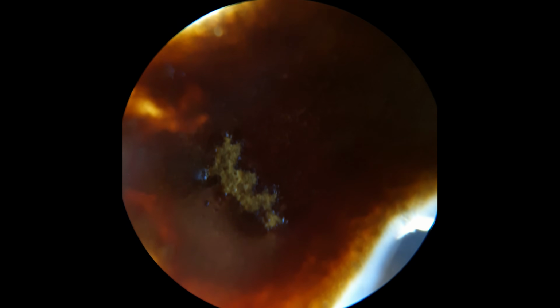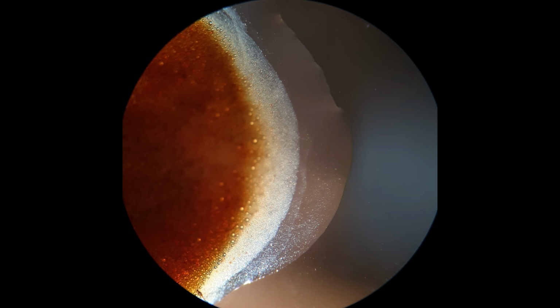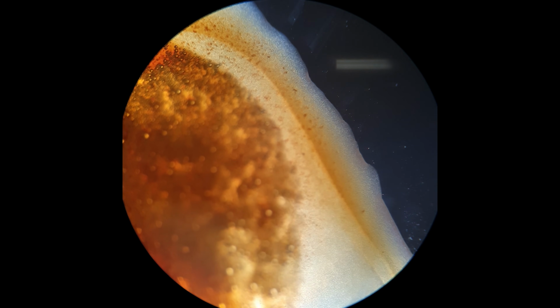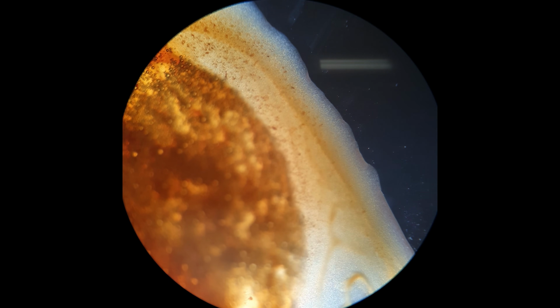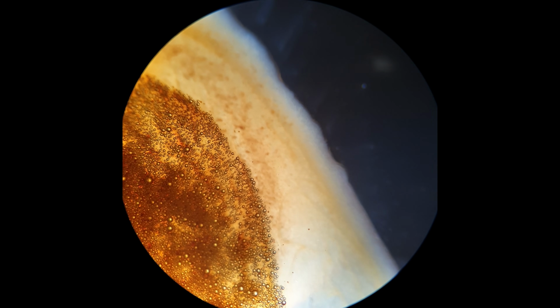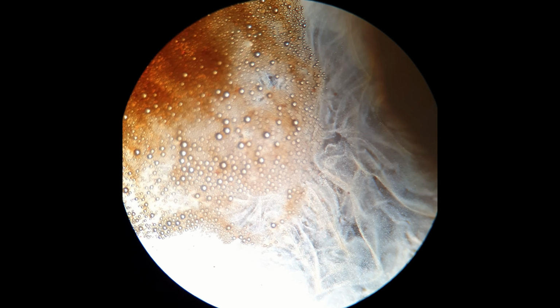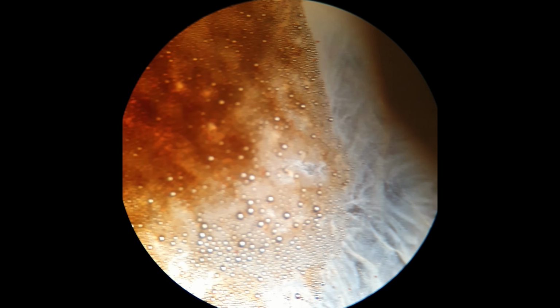Now I thought I'd show you this because those bubbles of carbon dioxide are really, really clear on the glass. And it's pretty surprising at just how much gas is still inside of the instant coffee, even after it's been processed. You'll see some movement there, and that's because when you're looking at things under a microscope, the water starts to evaporate off the slide, and that creates these currents in whatever you're looking at.